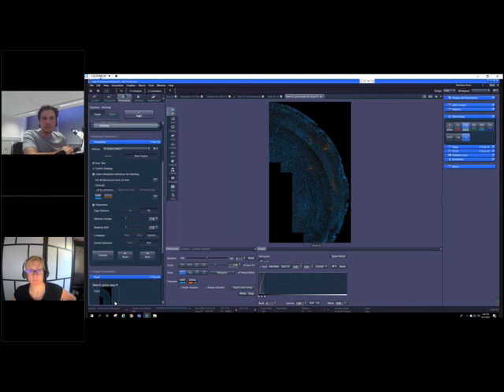The only thing, if you would like to run this online as we did, you need the framework of the direct processing module, which you can set up on the same machine, or on a network machine. This is an additional module, which is not in the free version, but for offline processing of your data from your microscope, we provide this algorithm already within the free of charge version of Zen.